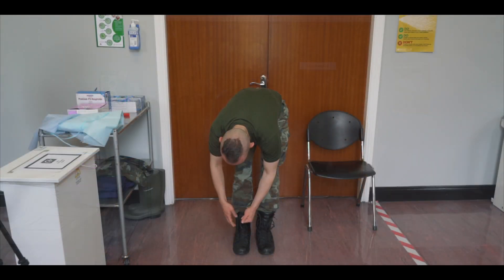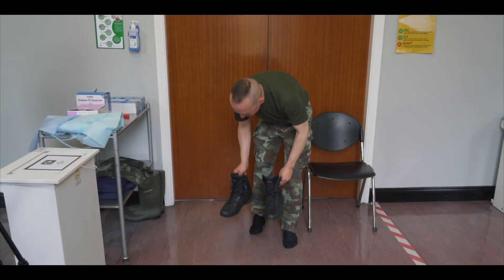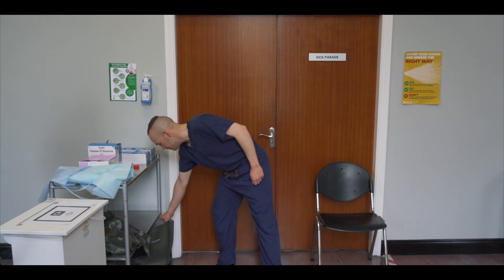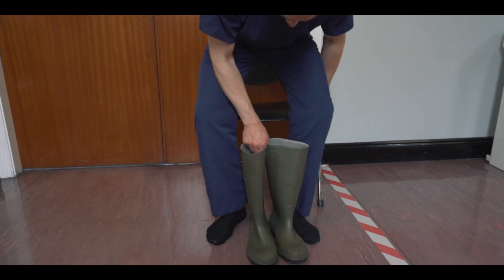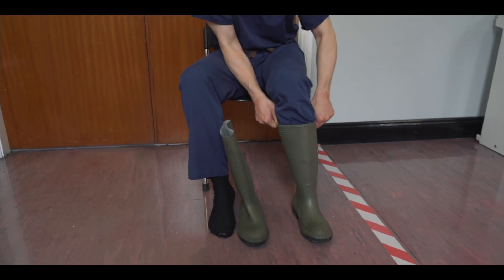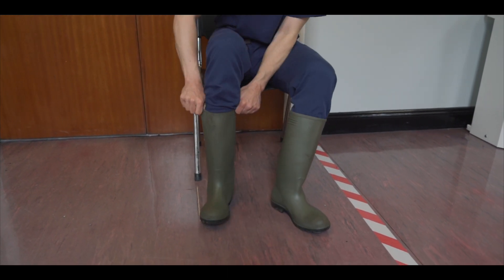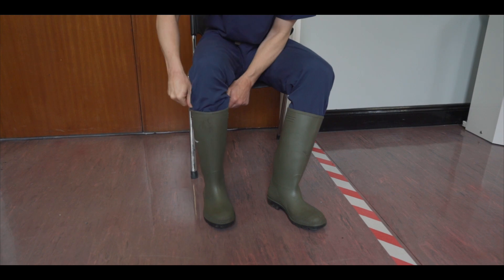Begin by removing your clean uniform and store in a clean area of the green zone. Remove your footwear, store safely and don a set of medical scrubs. Select a pair of wellington boots, choosing one size larger than you would normally wear to ensure easier removal of the boots during the doffing stage. Sit on the chair provided and ensure you tuck the scrubs into the wellingtons.